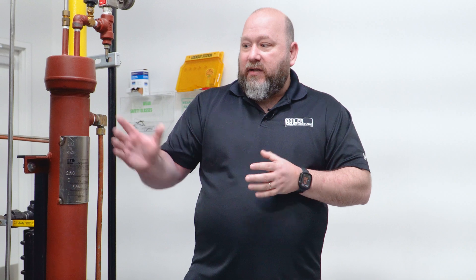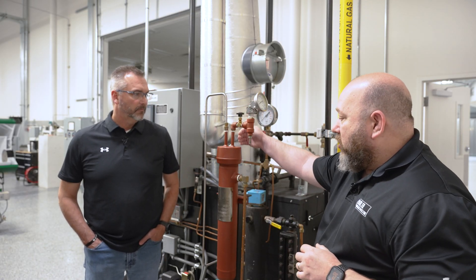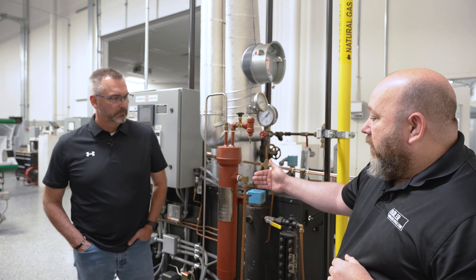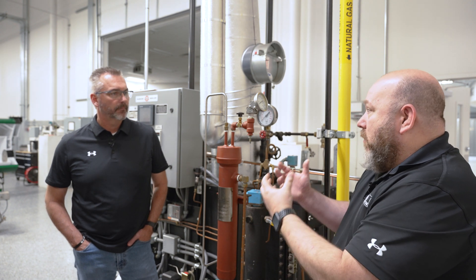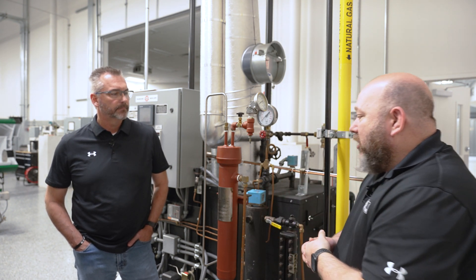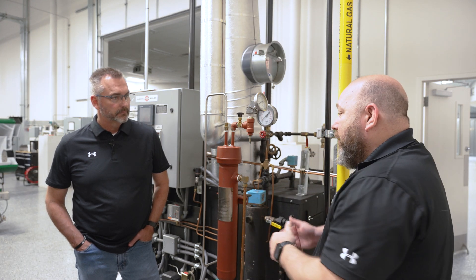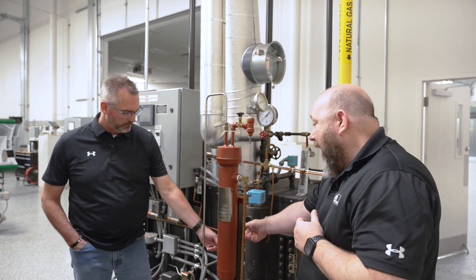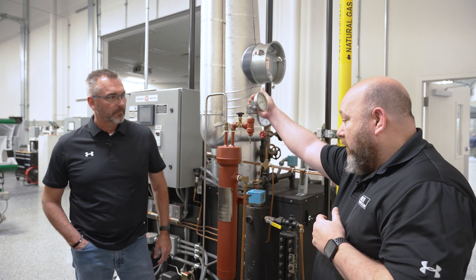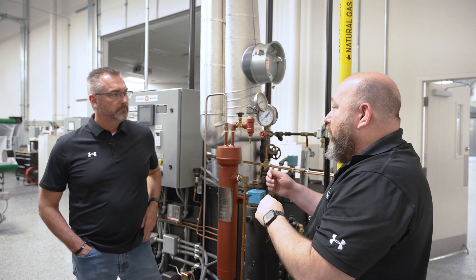It's a coil that is inside this vessel. Along with the sample that comes in through that coil, you have a cooling water line that pipes water around that coil and submerges it — and that's where you get your cooling from. So when taking a sample, you would open up your water supply, make sure that you have cold water flow coming through, then open your sample line and make sure that you have a place for that to flow through. Then you have a valve that, when you're ready, you open to take your sample.